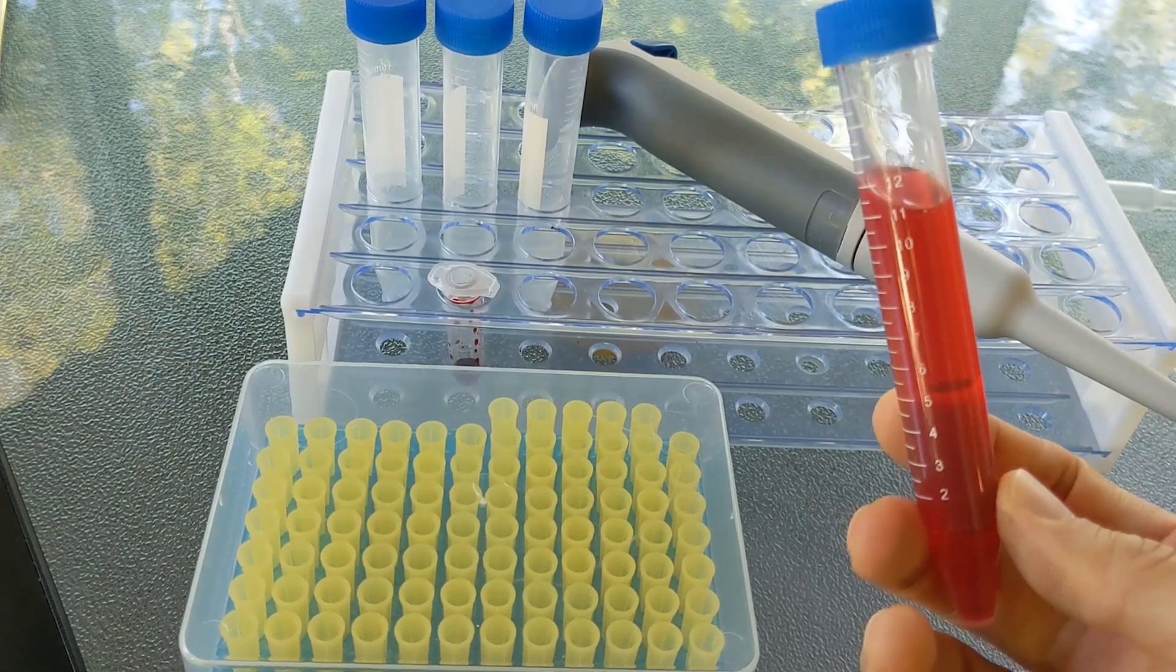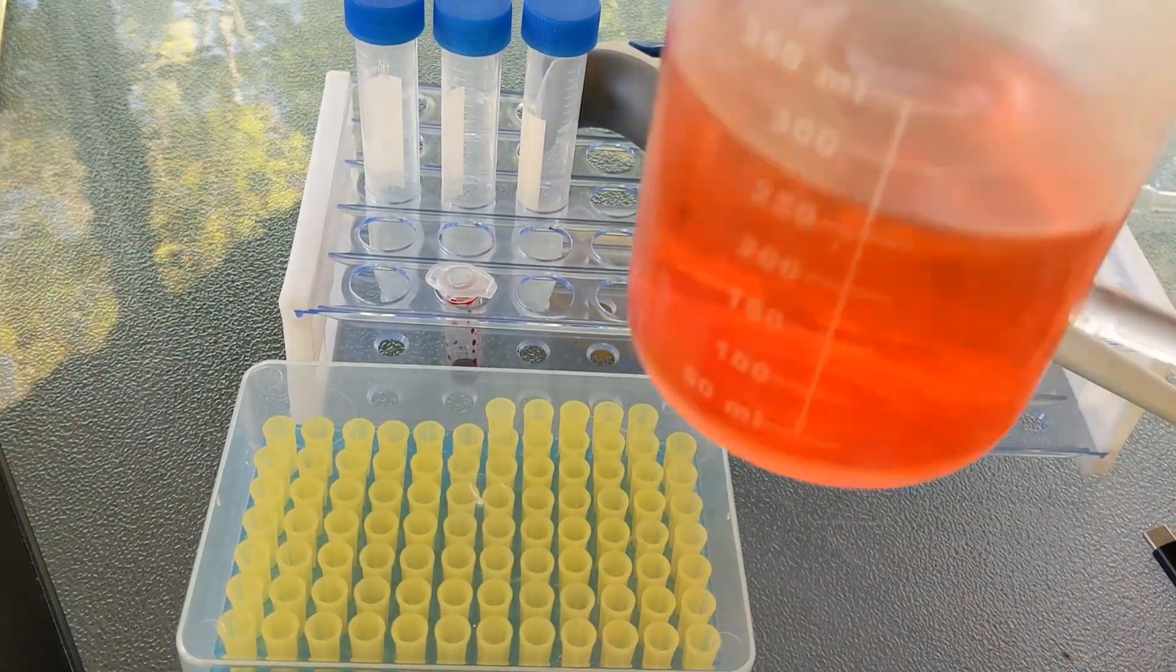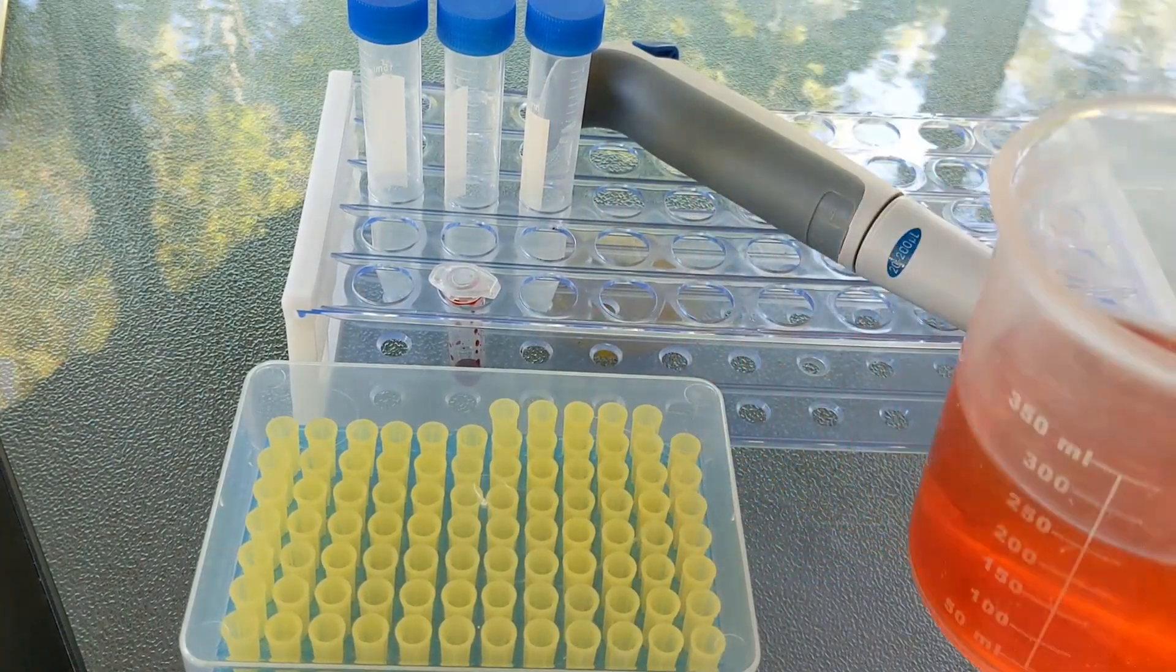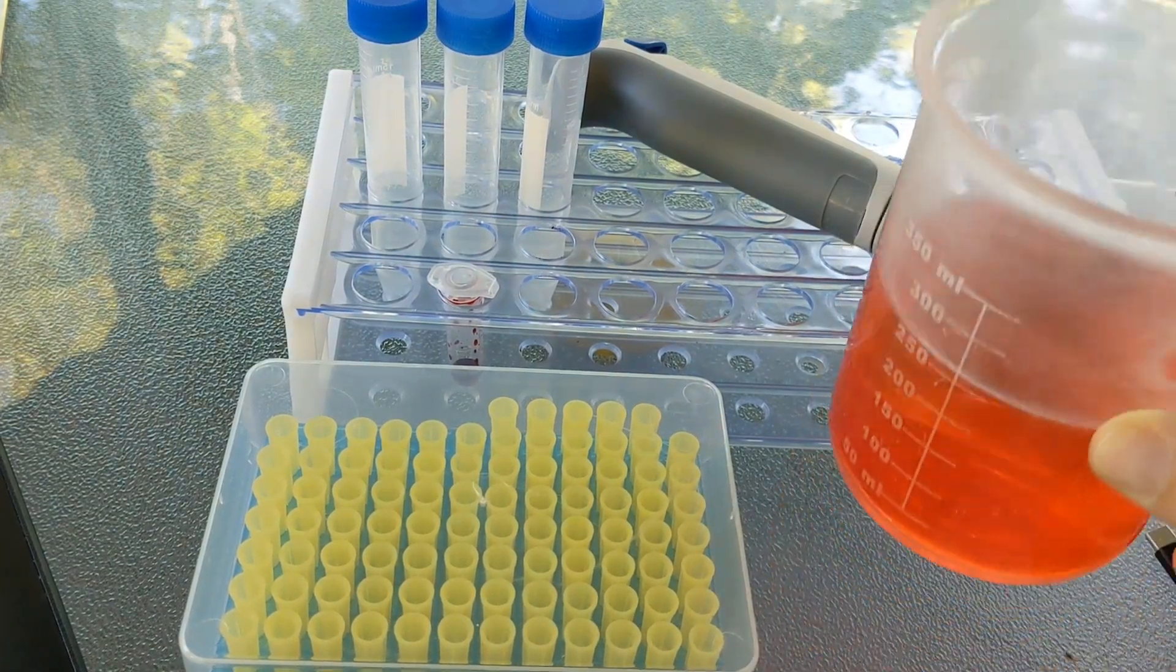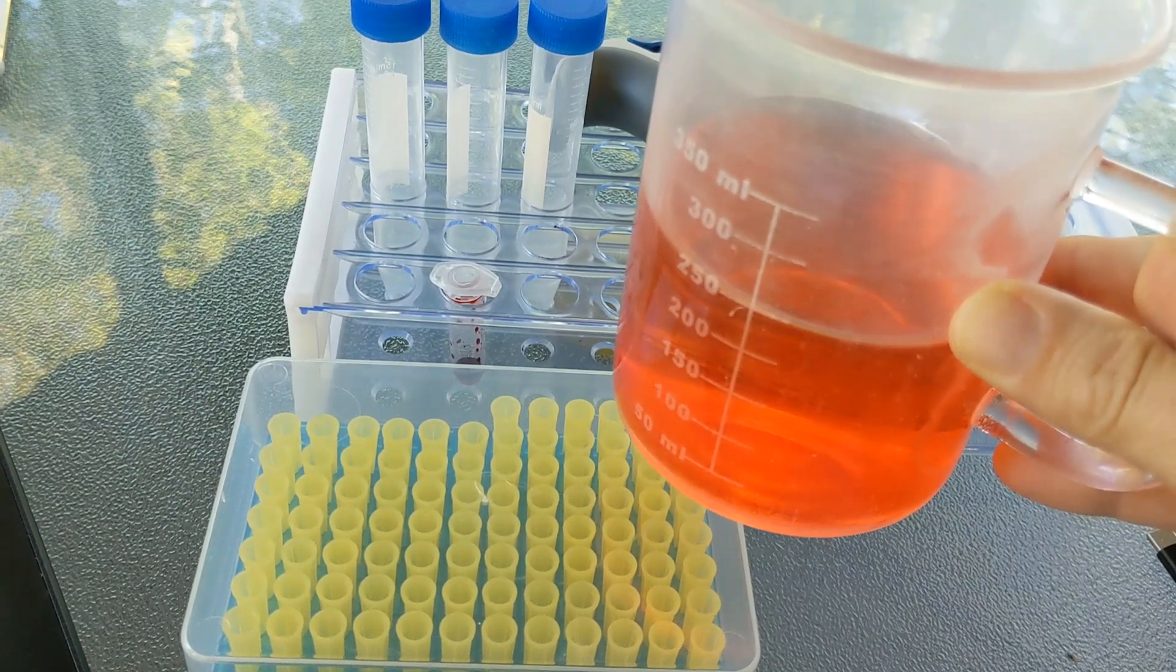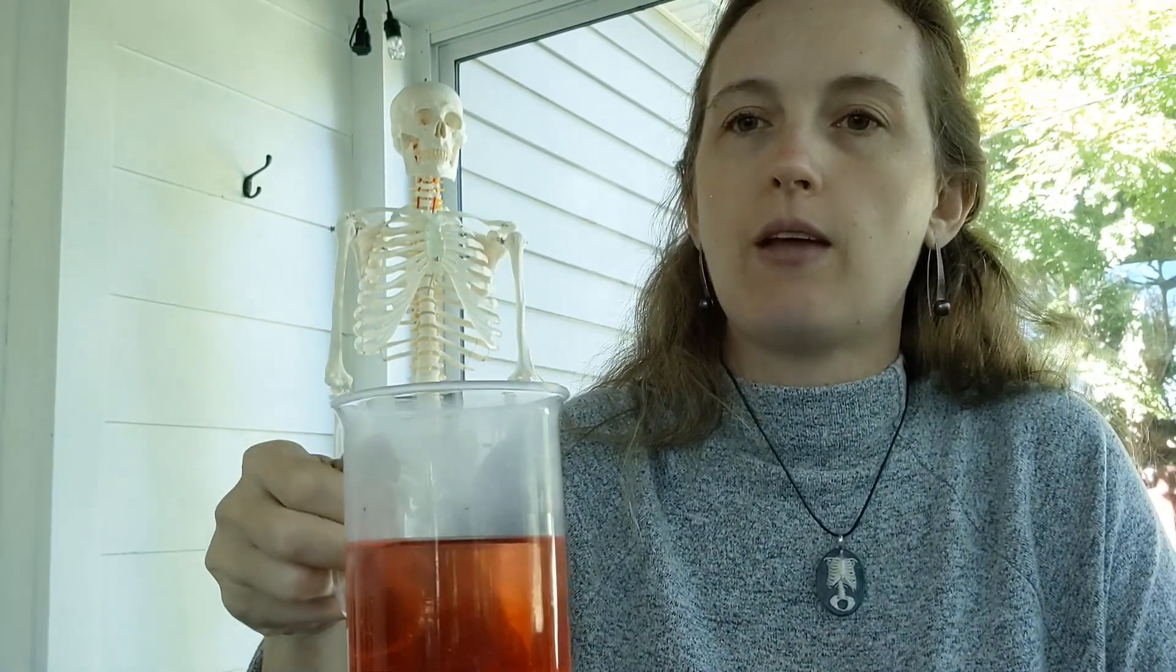One of the things they really need to take away is it doesn't matter if this solution is in this beaker and they get 250 mils, or it's in a giant beaker, or it's in a teeny tiny container. The concentration is the ratio of dye to solution, and so it's not affected by total volume. Be ready when you do this lab with your students for them to look at you like, what are we supposed to do? I usually just tell them the goal of this lab is to figure out the concentration of this mystery solution. And again, I've done activities with them beforehand with pipetting and with solutions. You can see the links down below to those. They should have everything they need to do this, but they have to problem-solve to figure out how are they going to figure it out.